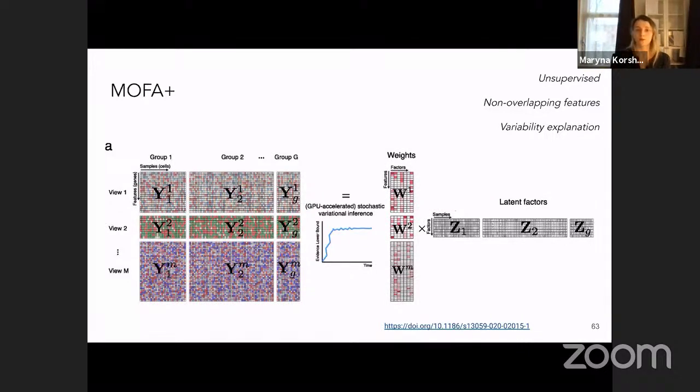So also, one of the advantages is that for the features you are going to observe using MOFA, the overlap between these features could even be absent. It means that you can analyze these different data modalities with no overlap, because usually you need overlap to match these data and do this assigning of different clusters or groups, or explanation, like linking different modalities. And here it's good that you can operate with no overlap.